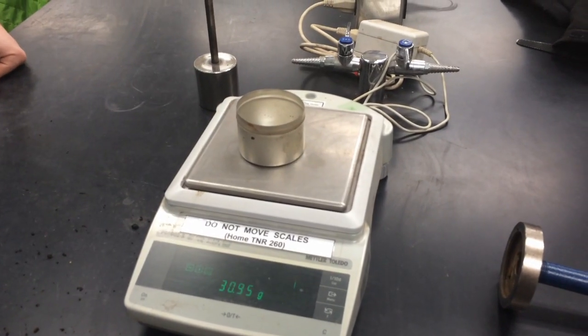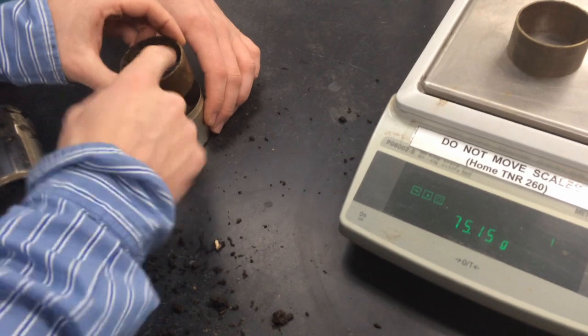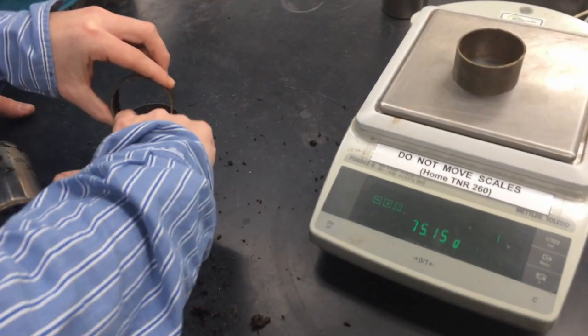Weigh an empty soil tin and record its mass. Empty the ring of soil into the tin, making sure to get all of the soil from the edges of the ring.